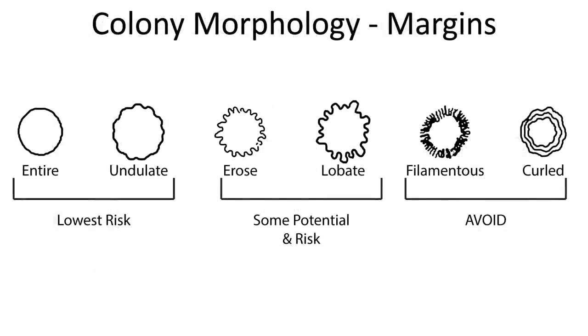Another thing worth looking at is the actual edges of the colony. Typically the organisms we're looking for will have a very smooth and even — what we'd call an entire — border, where the whole margin is consistent, nice and smooth and continuous. Colonies that are a little bit bumpy around the edges are okay too, but if you start getting into stuff with fuzzy edges, really lumpy edges, or that looks like a series of colonies growing on top of each other with the biggest on the bottom and smaller ones growing up — those are things you would want to avoid.